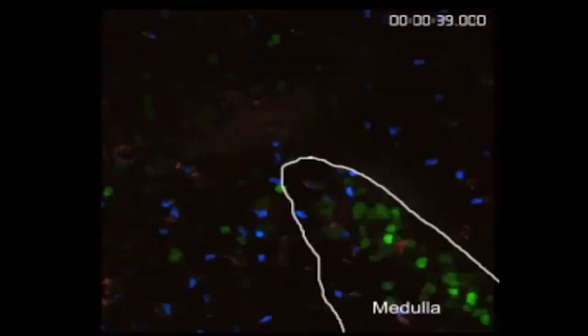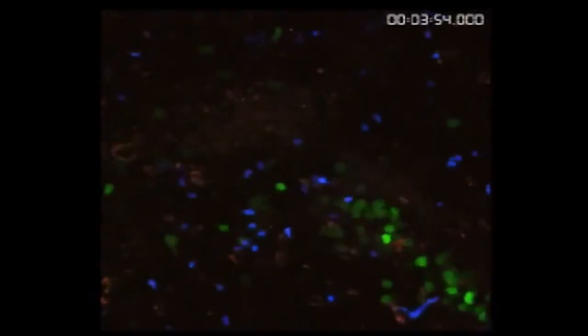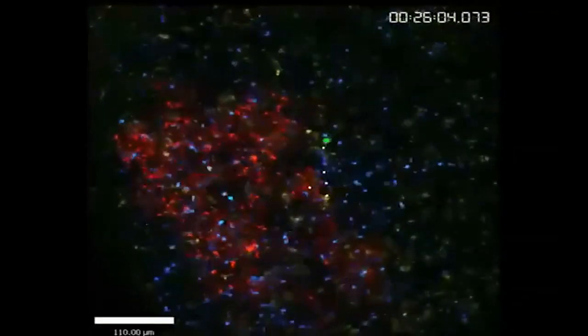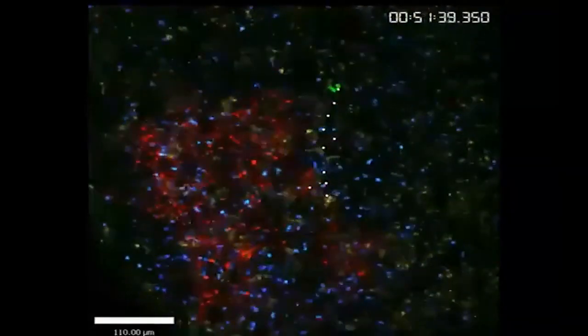And here, right when they're very close to the medullary cords, we can still see cells migrating away from the structure, suggesting that they're not migrating in some type of chemotaxis, but more of a random migration, even though they accumulate in this structure. This migration is also very unique to plasmablasts or antibody-secreting cells. We don't see this in normal lymphocytes or other lymphocytes that have been characterized in the lymph node.